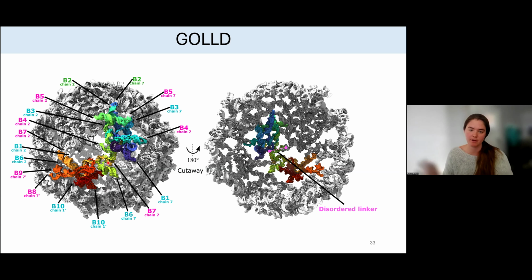If we flip it around and look at the inside, that is where the 3', 5' domain linker is. Remember that this linker between the two major domains of this RNA was unconserved in sequence. It also appears to be disordered, so we do not really see much density where that linker should be. So I've just drawn a connecting line here.